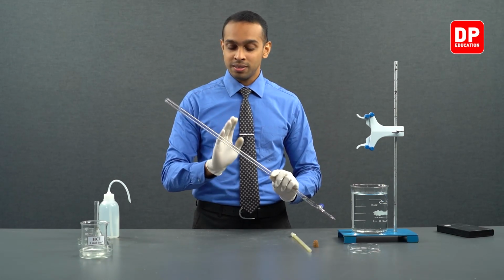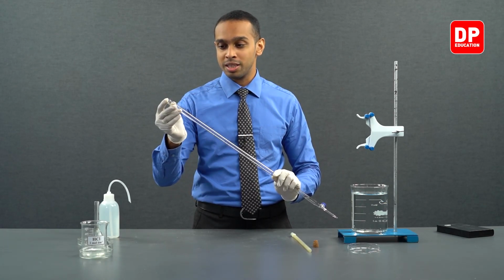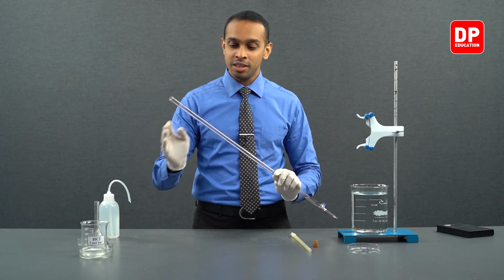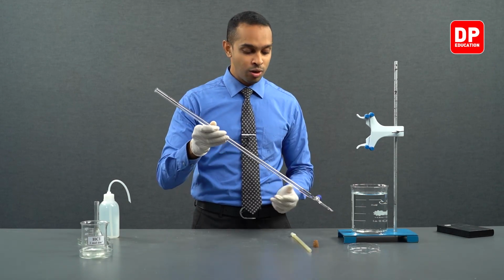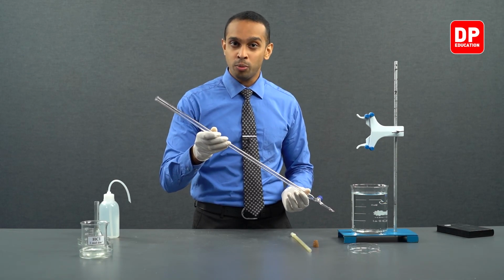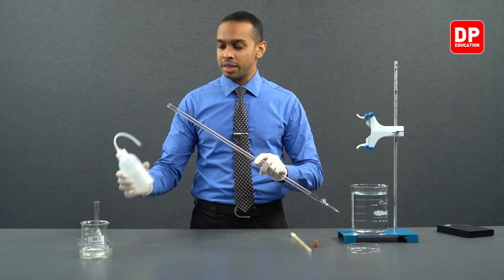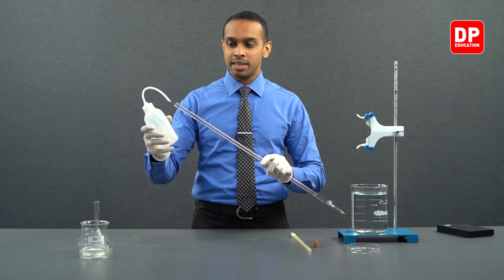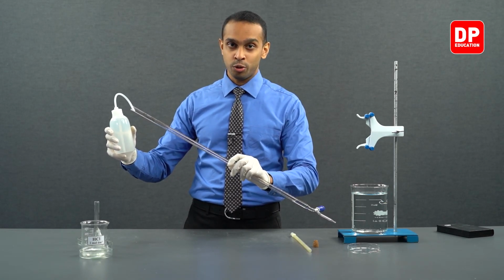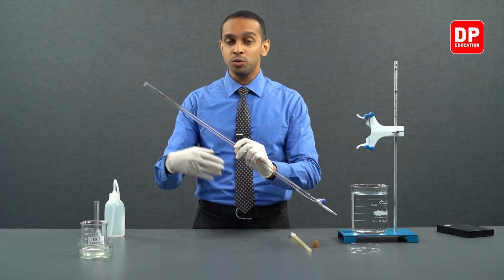So to avoid HCl coming into contact with the magnesium strip as soon as we introduce it into the burette, we have to make sure that we add water to this burette in such a way that it does not allow the HCl here to get mixed evenly and produce a homogeneous HCl solution. So I'm going to be using a wash bottle, and I will be adding water along the wall of the burette so that the HCl here does not get disturbed enough to mix well with water.